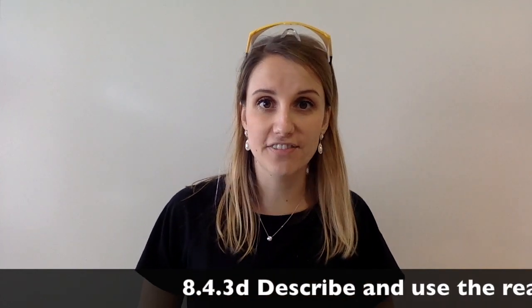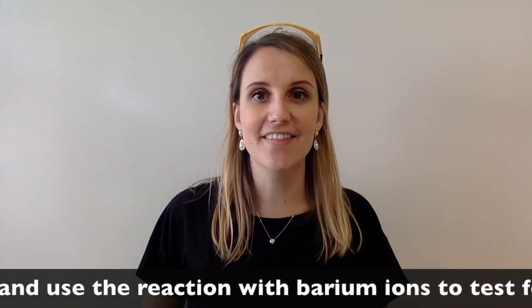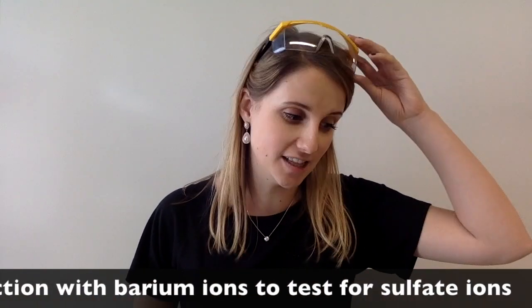Hi, guys. This video is about the test for sulfate ions. So let's have a look at the experiment first and then crack on with the equations.